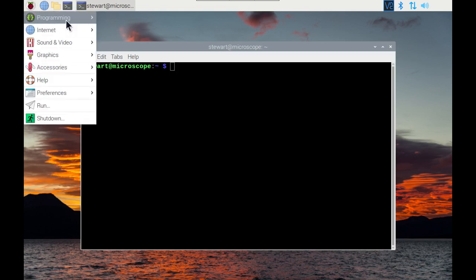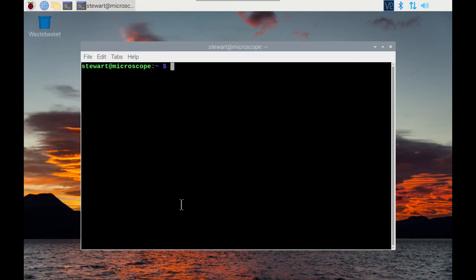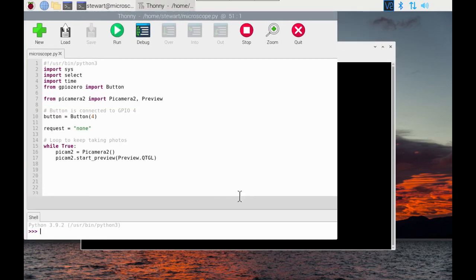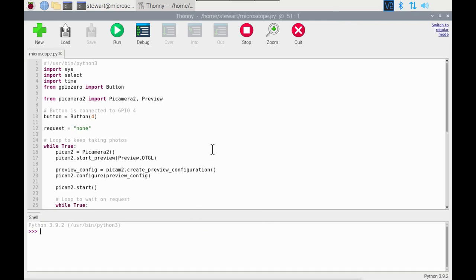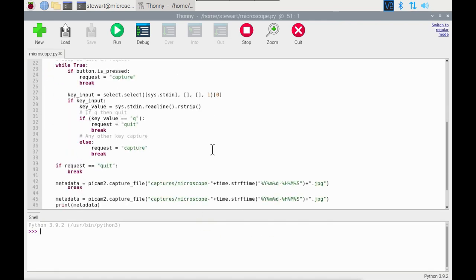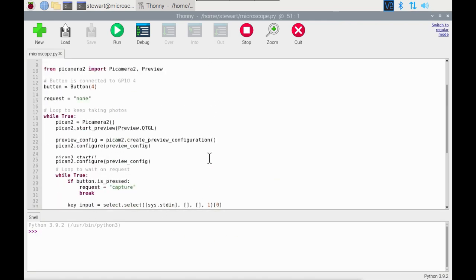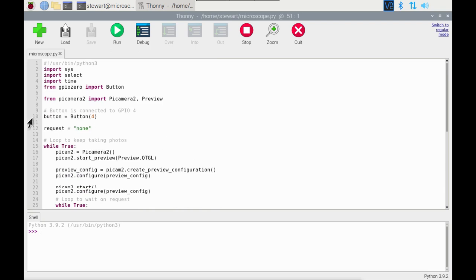So here's the code I've created. I'll open it in the Thonny IDE and then we can have a quick look through it. It's not huge, it's just short of 50 lines long which includes some spaces and the comments. I'll import some libraries we'll see those in use in a bit.